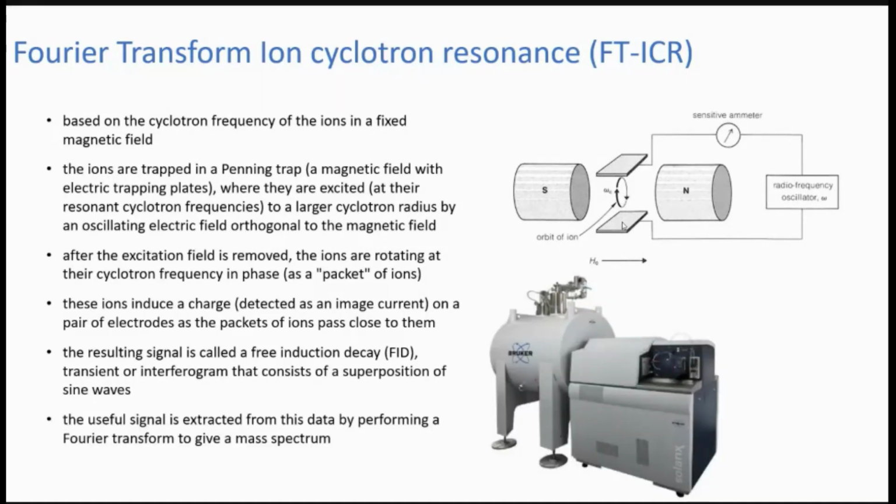So really, we're talking about sine waves. You end up having these ions moving based on the magnetic field, and you can measure their frequency; depending on their mass, they're going to have different frequencies of orbit. Your output that's technically getting detected is frequencies. Then, in order to read that signal, because it's very complex and very cyclical, you use Fourier transform math to transform that into a mass spectrum.